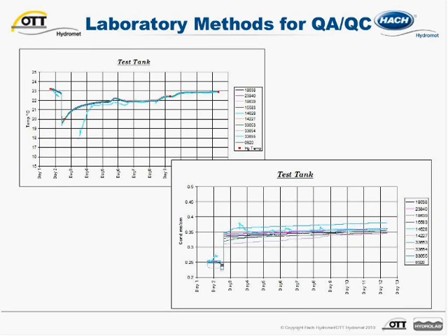In the lower right hand section of the slide, we have conductivity data from the same 10 instruments that were in a laboratory tank over an 11 day period. We see some variation from the group, not as tight as we would like. This may be an indication of sensor problems or poor maintenance.